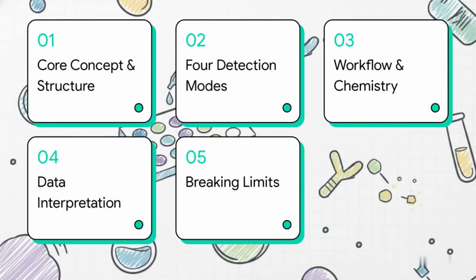So here's a quick look at our roadmap. Section 1 covers the core concept and antibody structure. Section 2 explores the 4 main detection modes. Then in Section 3, we'll get into lab workflow and color chemistry. Section 4 tackles data interpretation and the standard curve. And we'll wrap it all up with Section 5, breaking limits and perfect synthesis.